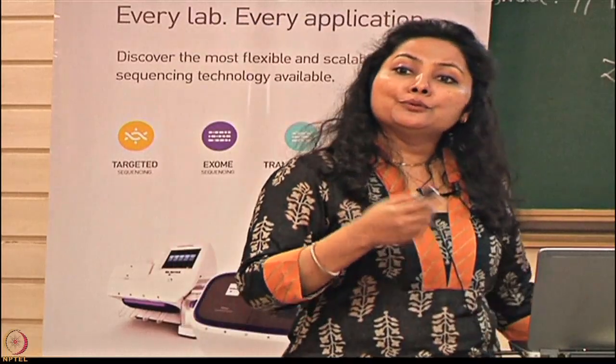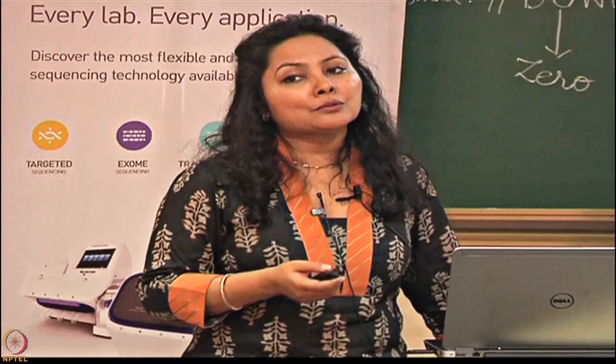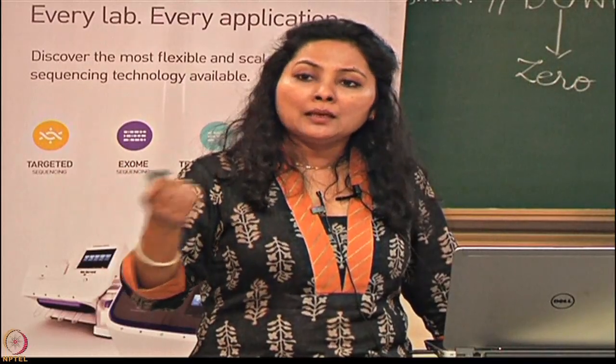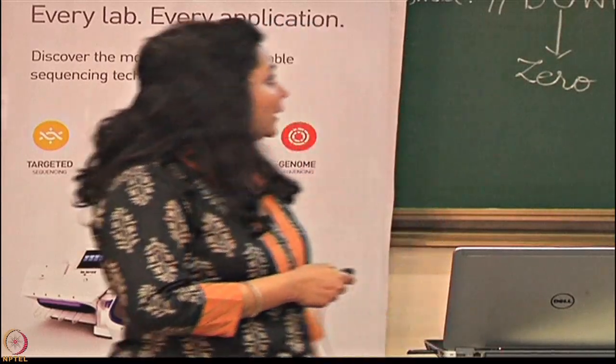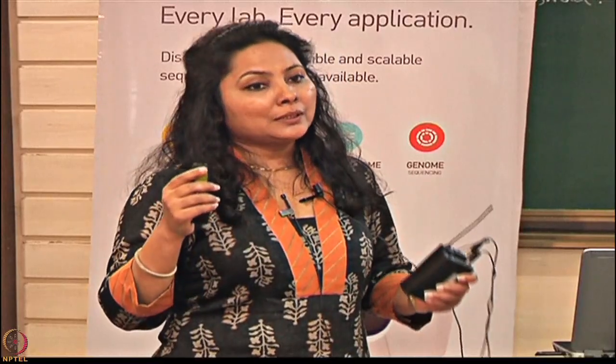The aim is that when you're doing small RNA sequencing for all these samples, you generate an equal amount of data for all these samples, because otherwise probably some of the samples have worked out pretty well and some will not. So to ensure that, you need to pool all these libraries in equimolar proportion. So once you've pooled that, after your library preparation step, now you started with 12 samples or you started with 20 samples, now that becomes one sample. And now how are you going to differentiate? Because it is now one sample, but you started with 20 samples. So when you generate the data, how are you going to differentiate?